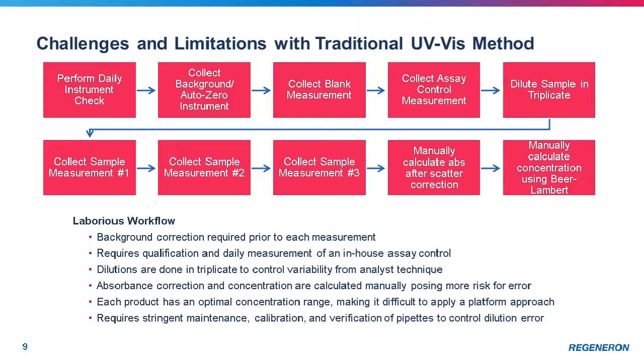Depending on the target concentrations, sample preparations may also require serial dilutions to avoid pipetting small volumes. Proteinaceous material is especially highly viscous, which can lead to variability and inaccuracy when pipetting small volumes. On top of diluting in triplicate, QC methods may require daily pipette verifications to ensure the pipettes used for the dilutions are accurate and that the analyst is able to precisely deliver the required volume.